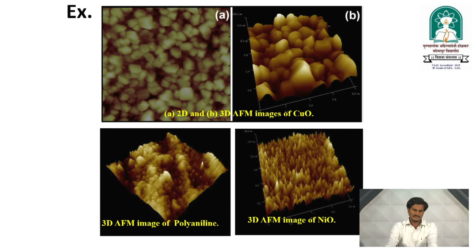Similarly, there are 3D images of polyaniline and nickel oxide materials, and these materials are also prepared in our Functional Material Research Laboratory in our School of Physical Sciences. This is about atomic force microscopy.